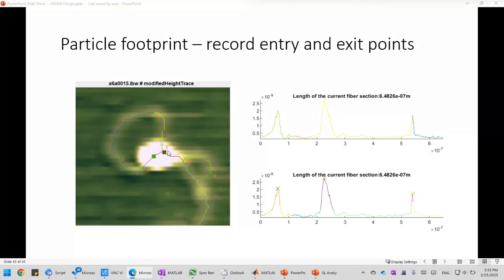And we do need to know the size of the protein. In other words, the range of the peak where the DNA enters the protein and where it exits the protein. So we need to know the size and the width of the peak.